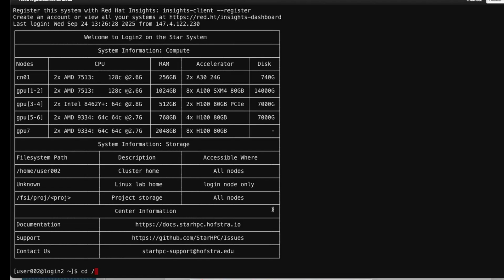So we're going to start at the root, and the first folder that we're going to look in is called fs1, and then dash shared, and then we're going to say lunch and learn, but that'd be a lot to type out. So you can try typing, if you tab after you start typing lunch and learn. So I typed LUN, and then I typed tab, and then it says, oh, okay, you want to go to the lunch and learn folder.